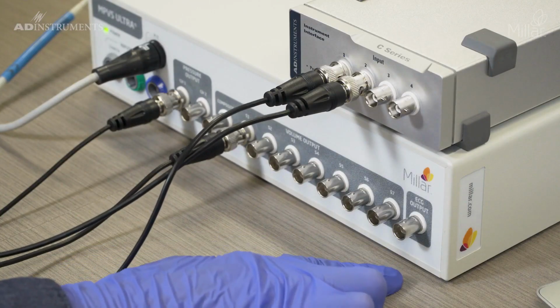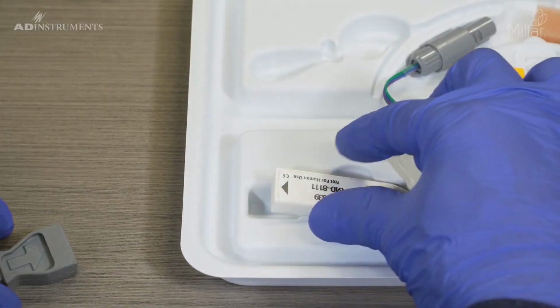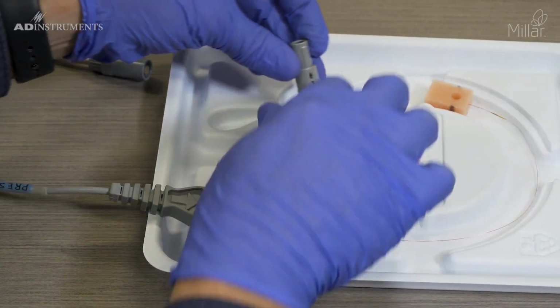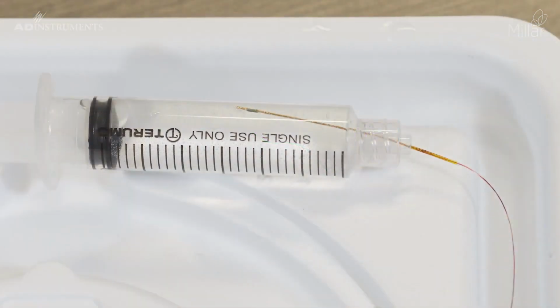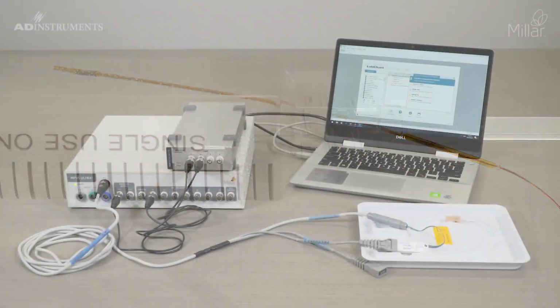The last output is for the ECG signal, should you choose the green input as described earlier. We won't be using this output in this example. Connect the PV catheter to the interface cable. It is best to do this while the catheter is still in the anti-static pink foam, to safeguard against damage due to electrostatic discharge. Remember to soak the catheter in 37 degree saline for at least half an hour before implanting.